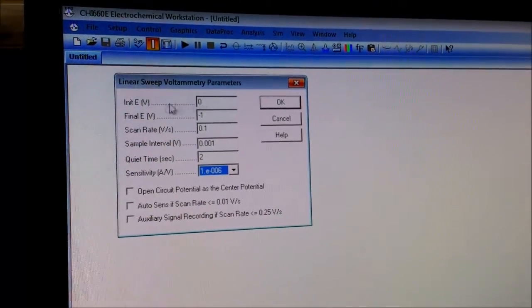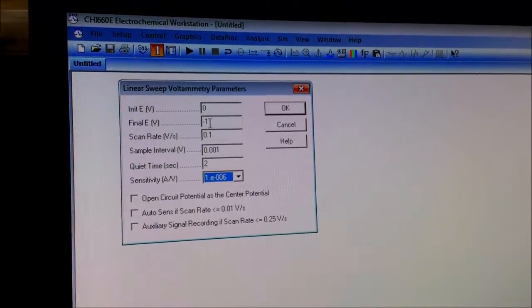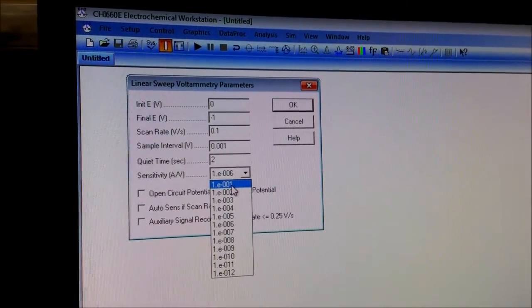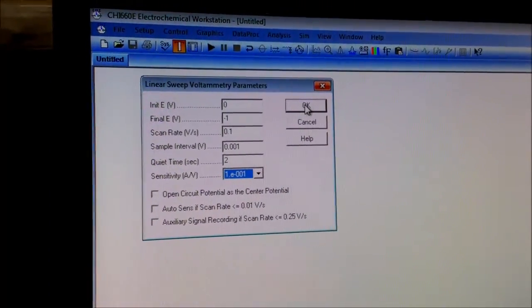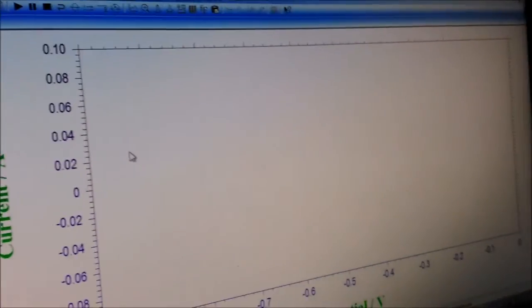I am choosing the initial voltage as zero volts and the final voltage as minus one volt. And let's choose the current sensitivity as 10 to the minus one. Now I will perform it — the LSV is being performed.